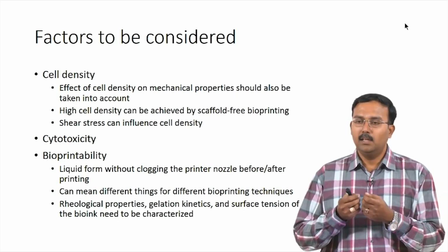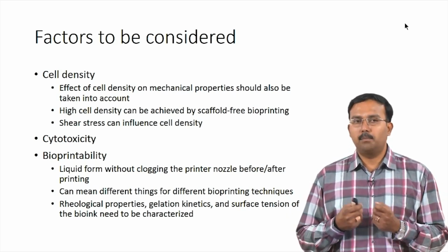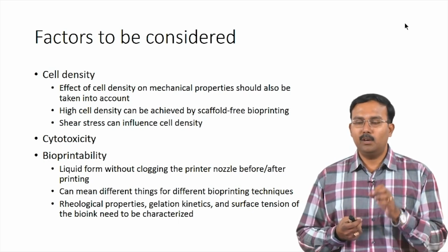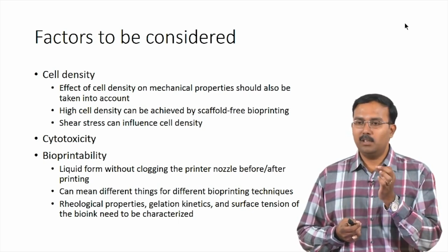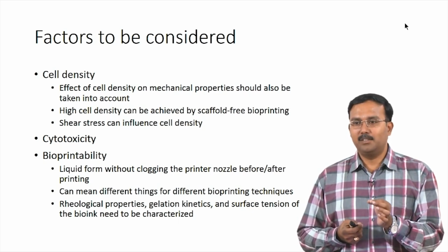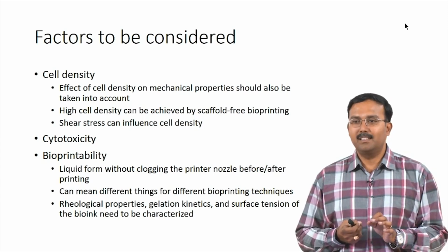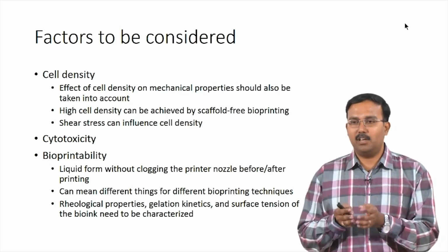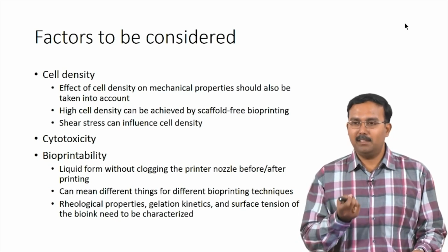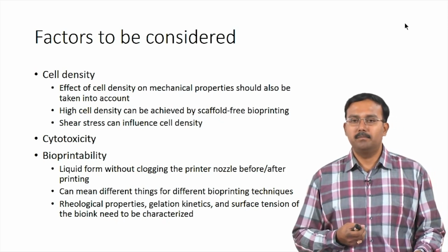You can look at using different materials for nozzles, but the problem usually is if you want very high resolution of printing, the nozzle is going to be very small, right. So, then clogging is a problem which you will face anyway. If you are looking at a larger diameter tube, then it is not a problem. If you are looking at micrometer kinds of diameters, then it can be a problem.